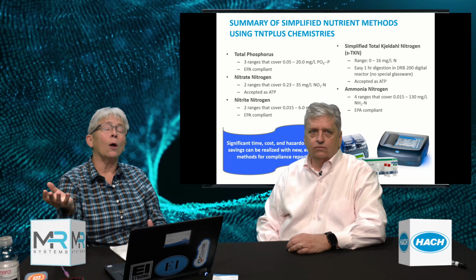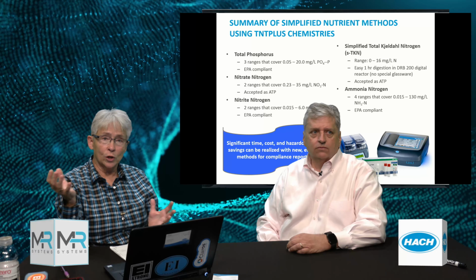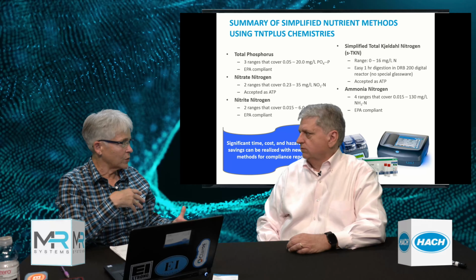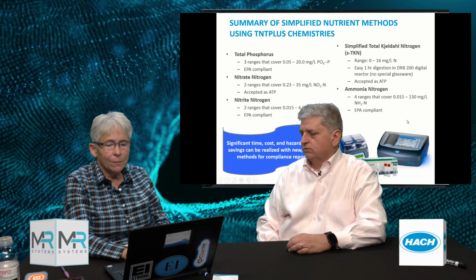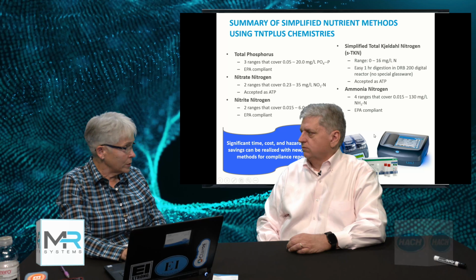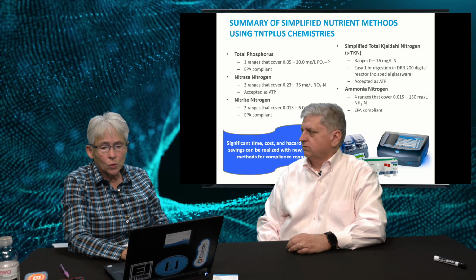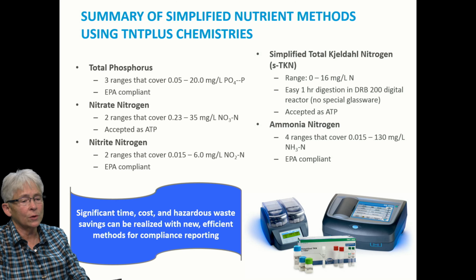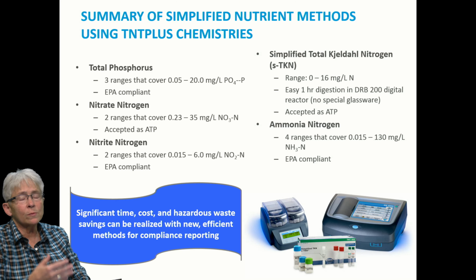For those of y'all who do not have large plants or don't have the budgets to have a lot of ammonia analyzers, phosphorus analyzers, the process control done by the laboratory is a really critical factor. And just wanted to point this out, many wastewater plants are using the Hach DR3900 spectrophotometer and our test and tube chemistries. They're running their plants by this every 2 hours, knowing what's going on. And granted, those are grab samples, they're not composite samples, but it gives them something to start with.